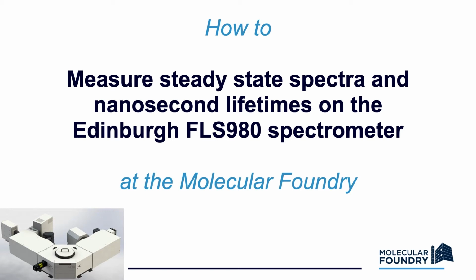This video will teach you how to measure steady-state spectra using a xenon lamp and an Edinburgh FLS980 spectrometer, and also show you how to measure nanosecond lifetimes excited by a pulsed diode laser. This tutorial is intended for first-time users that are being trained on the instrument at the foundry.